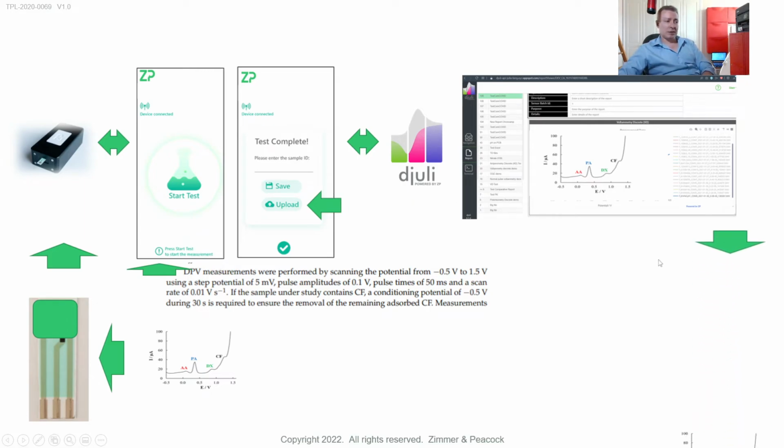In this database we can do peak recognition and ask whether we can see these four compounds. This is linked to the calibration, which is the second step, but I'll come back to this. The first step is almost like feature or compound identification. Within the context of analyzing, for example, wastewater from a pharmaceutical company, which would be a classic, are we able to identify compounds in that wastewater?